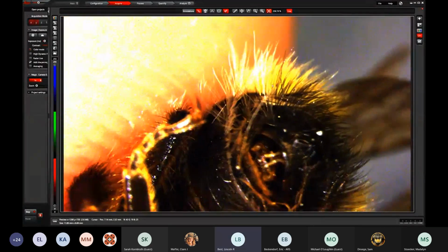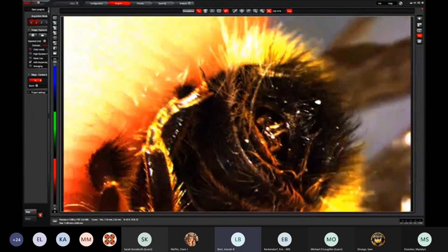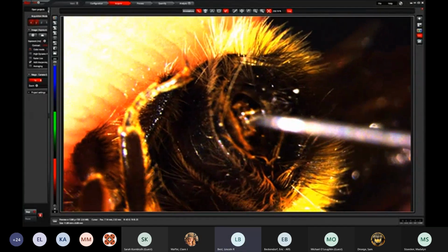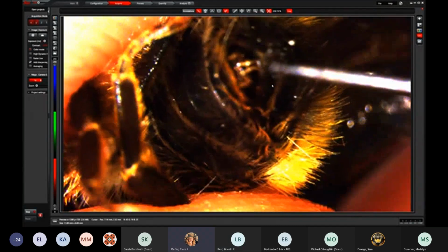So I'm going to zoom out a bit, and then the way to pop out the genital capsule, and just if I fade off the screen, just tell me to move it a little lower or higher. You're doing pretty good so far.